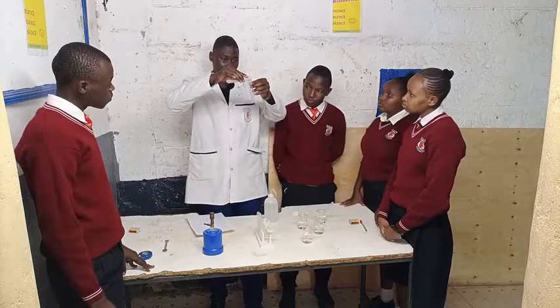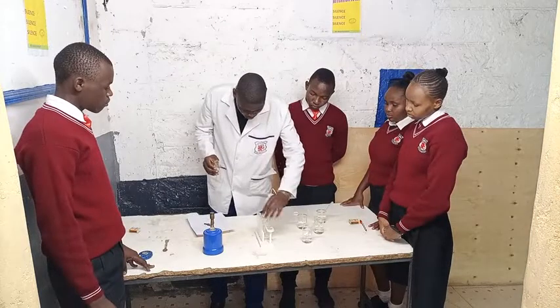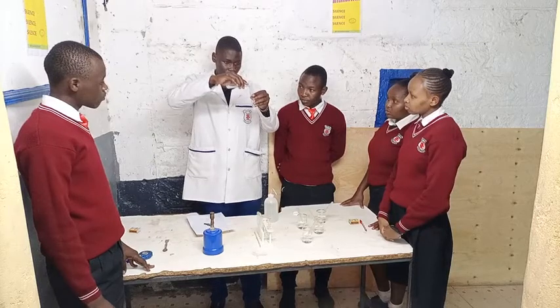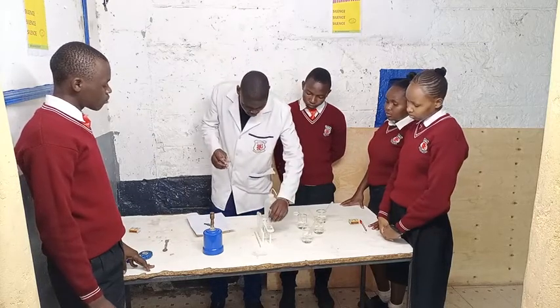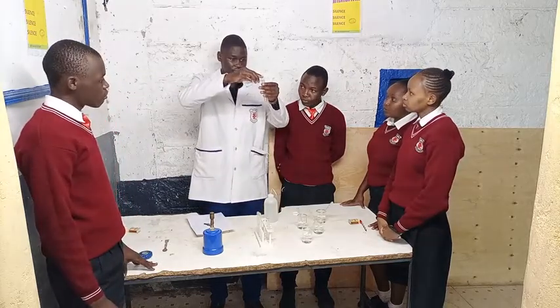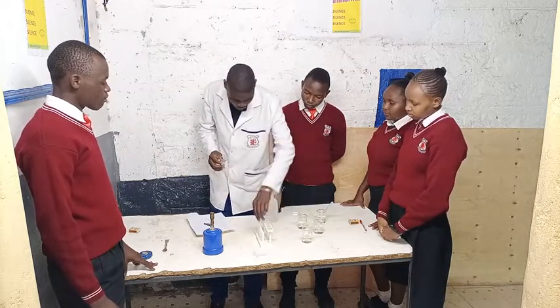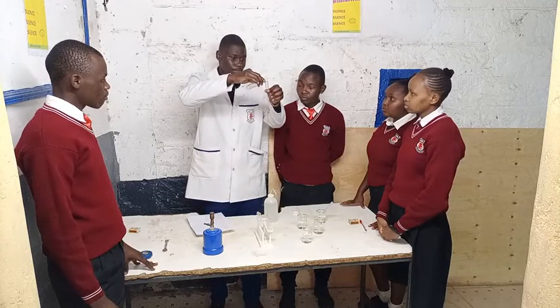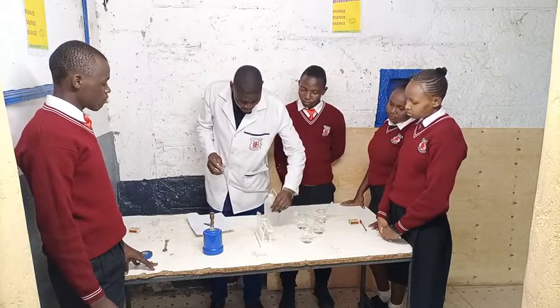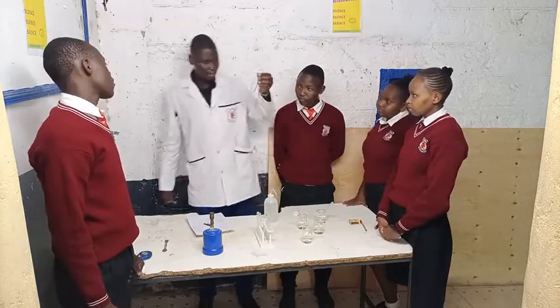You can just add equal amounts, just like this, into four portions, like this.